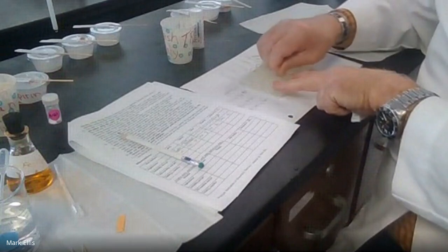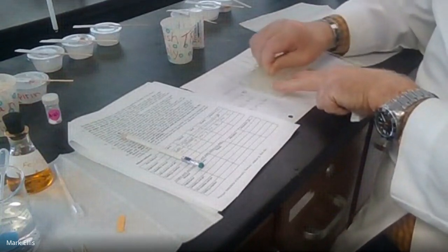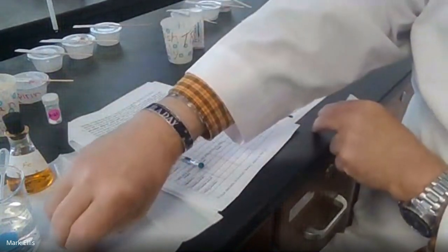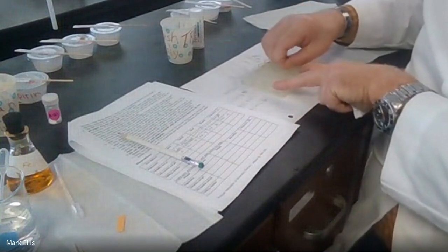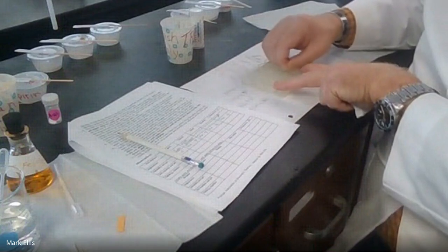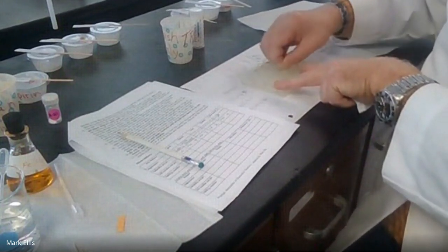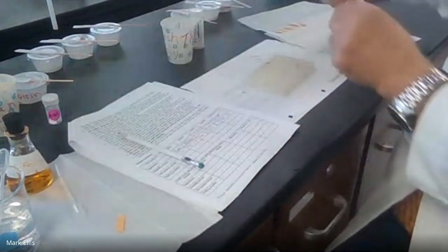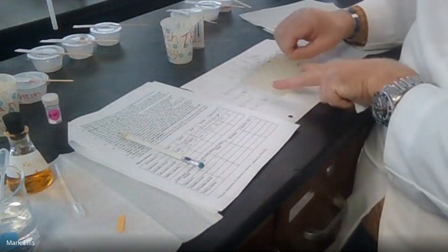Third row, second column. Stir, stir, stir. Trash. Third row, third column. Stir, stir, stir. Trash. And for my unknown, stir, stir, stir.